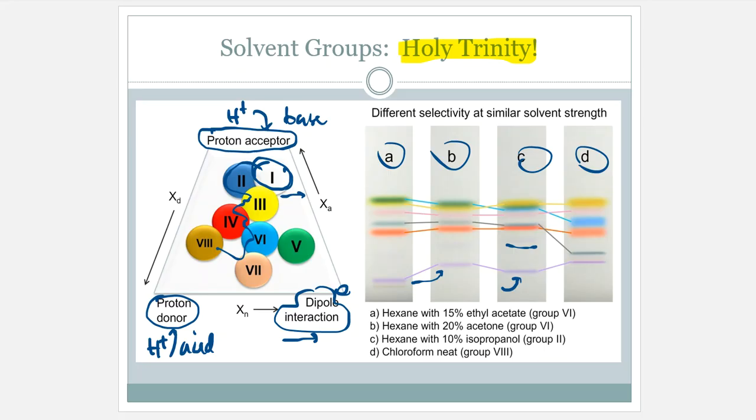But the whole idea here is to figure out a way that we can separate these and feel really good about what we did. And then in D, it looks like the purple went up, and this bluish band shows up a little bit better. This orange one is there, the blue one's there, the pink one's there, the green one's there. And some people might say, well, what about the green one?